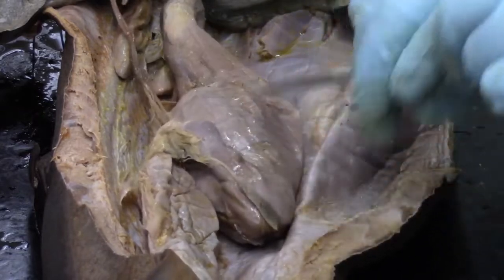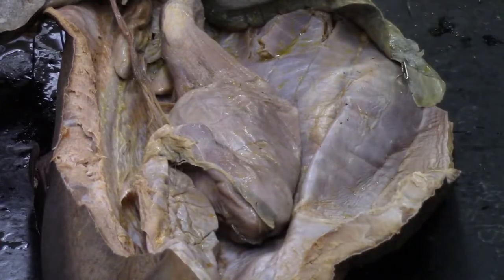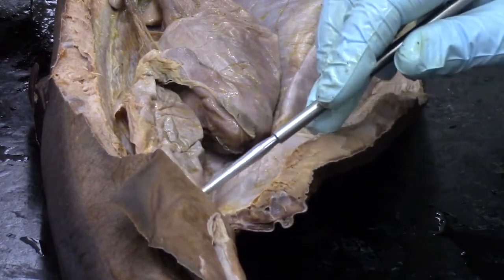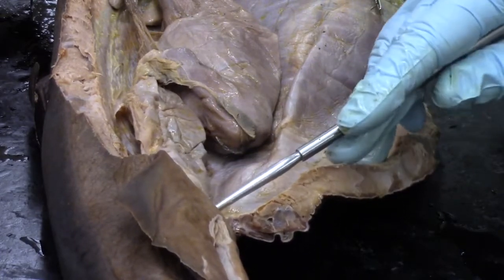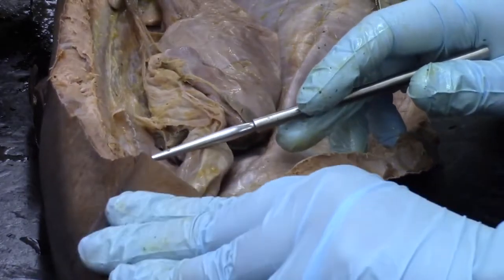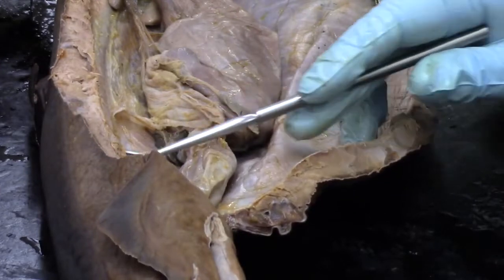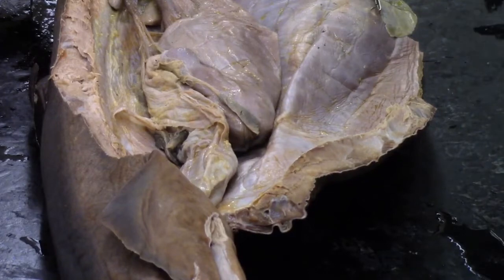The duodenum then continues to what's known as the spiral intestine. So we have that there. And then eventually the spiral intestine smooths out, and it will exit via the rectum. If we move it off to the side, we'll be able to see this finger-like projection here. That is the animal's rectal gland, and that's going to be used for osmoregulation, so controlling the salt balance.